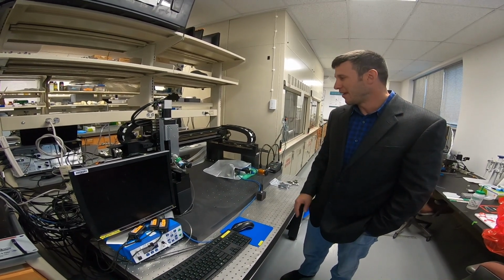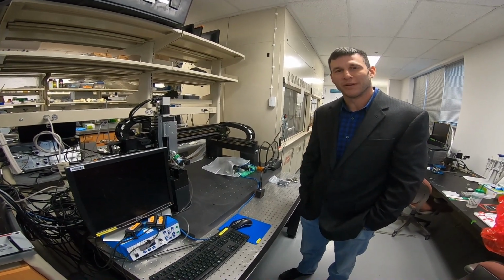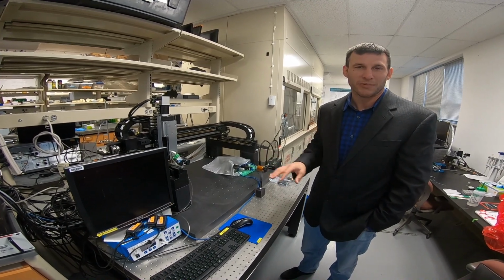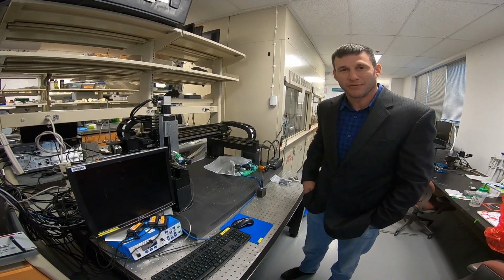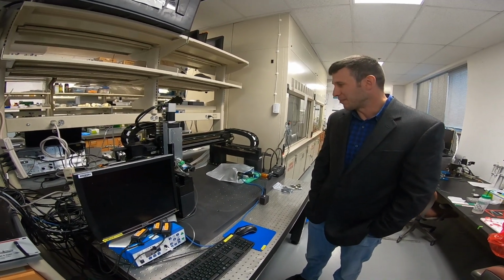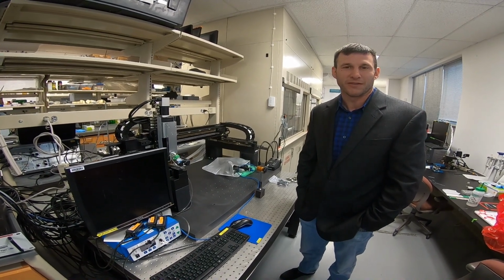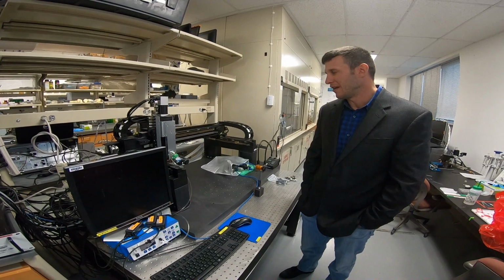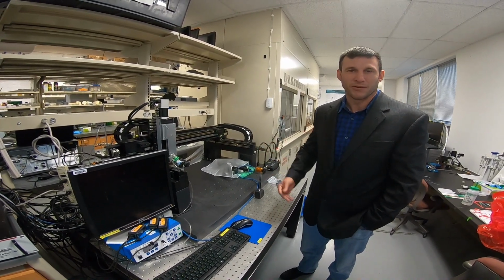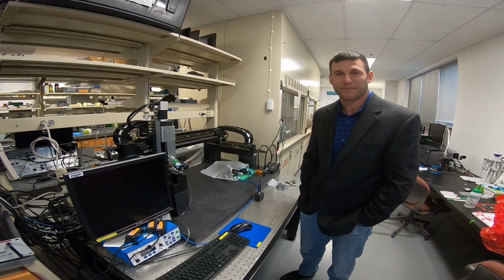So essentially these robots we leverage for manufacturing purposes, but we also leverage them for quality control inspection purposes as well. And one of the applications that we are uniquely working on in our lab is the ability to do additive manufacturing on moving surfaces and moving objects, and also objects that have non-flat surfaces, which is very important in the biomanufacturing field because sometimes we're trying to integrate printed materials, printed devices directly with biology. So there is a need to leverage automation technology and also to develop new sorts of path planning algorithms that can work for those sorts of applications.